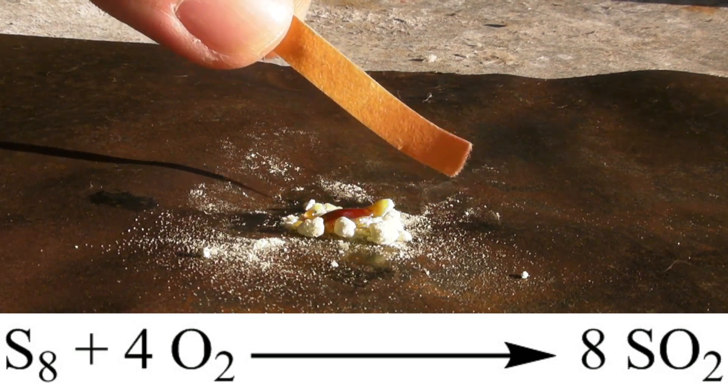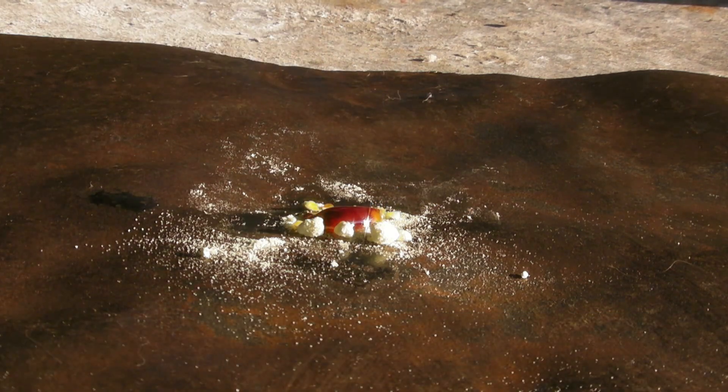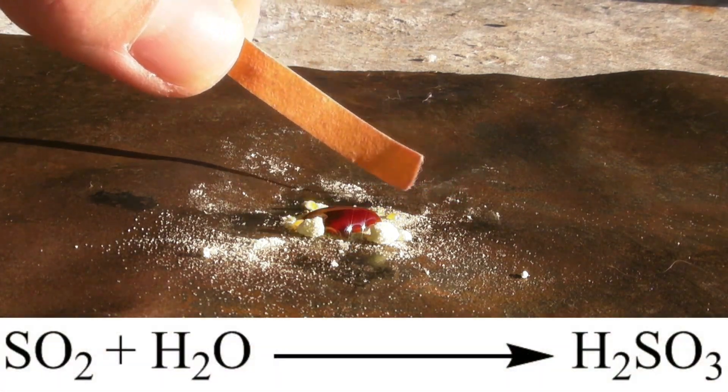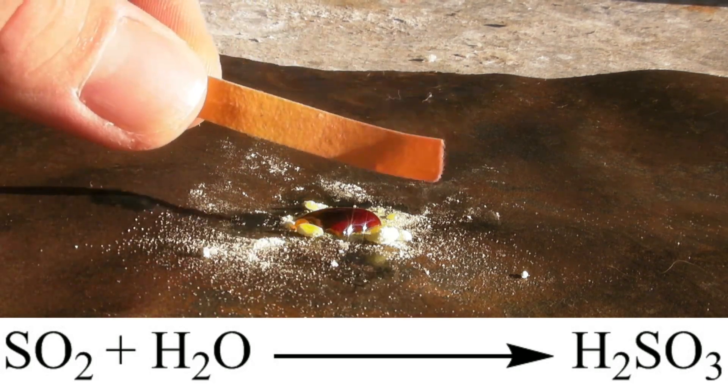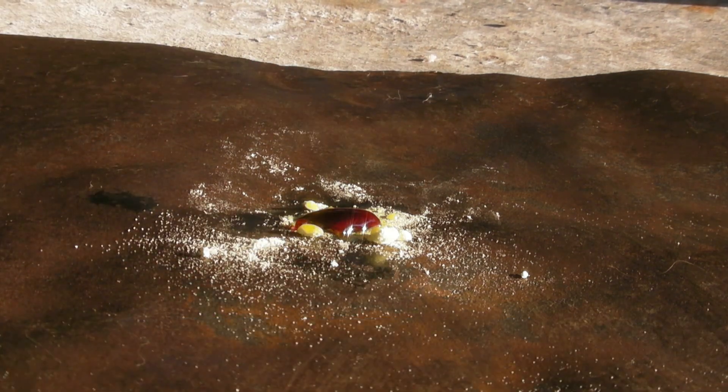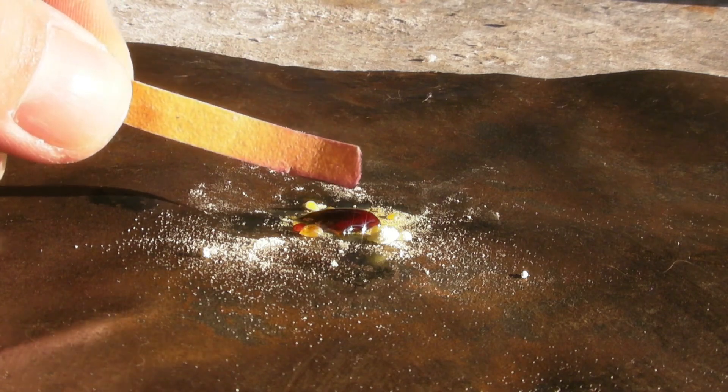Sulfur dioxide reacts with water to form sulfurous acid, which can be shown with a wet pH paper. That a flame is present is indicated by the paper getting burned close to the sulfur.